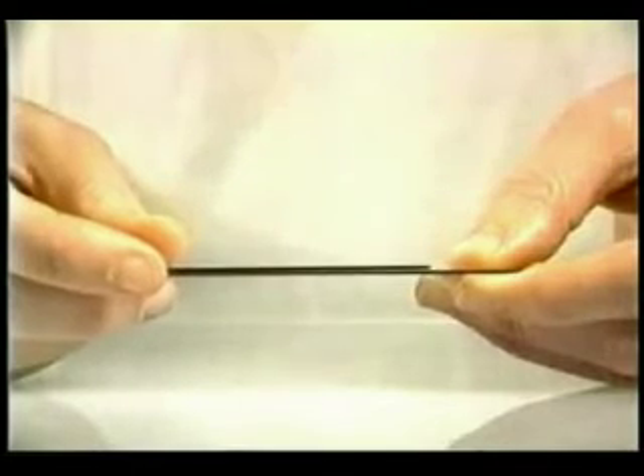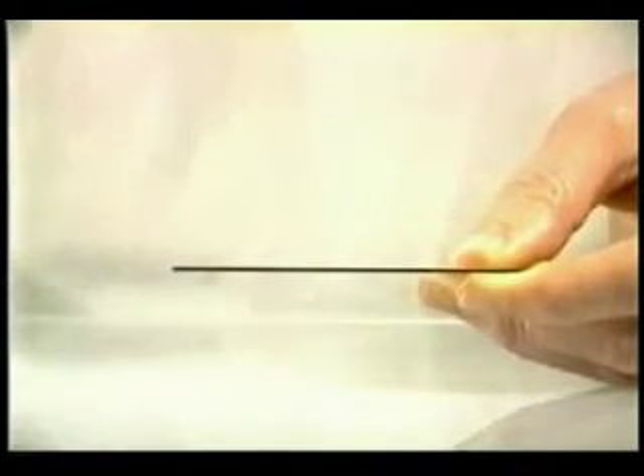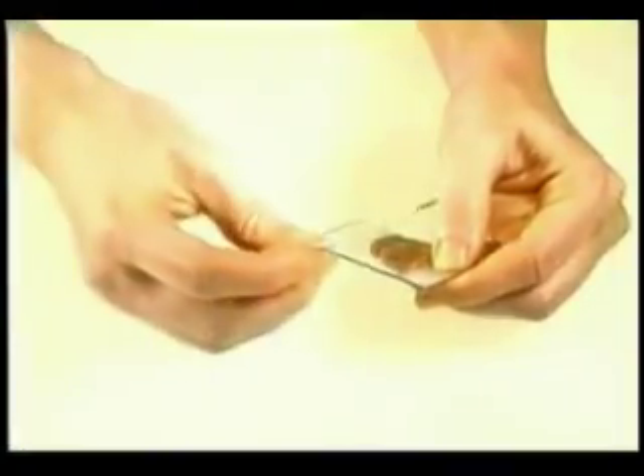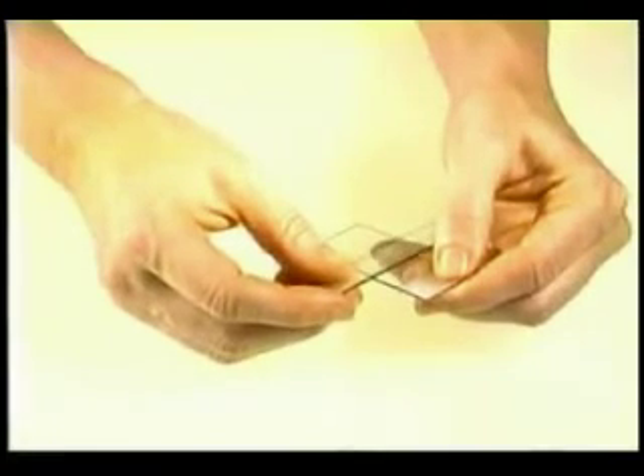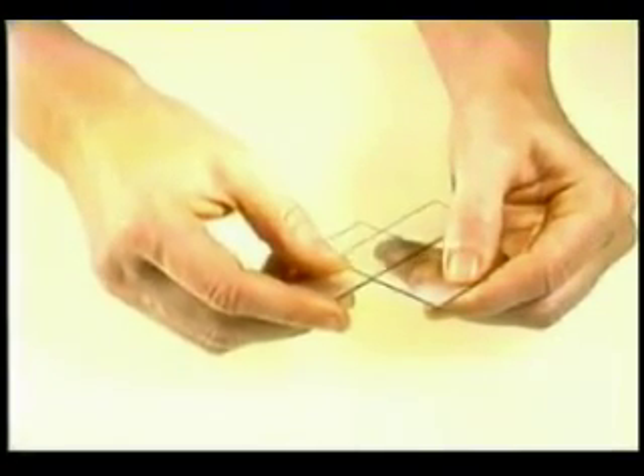Another possibility is to place two slides together parallel and pull apart. Both these techniques may initially be easier to apply, but the first technique is going to produce a more even smear and less artifact, increasing the chances for a correct diagnosis.